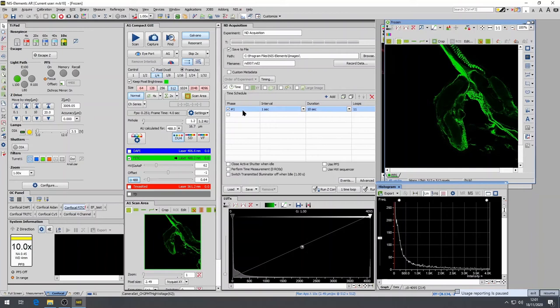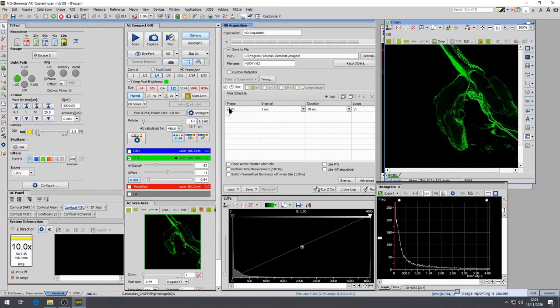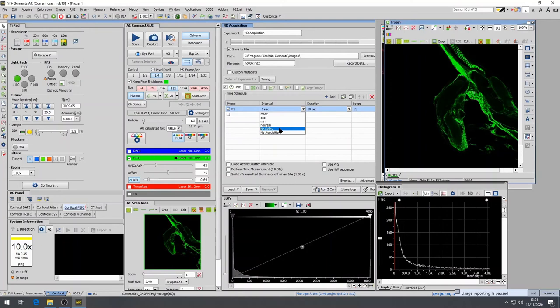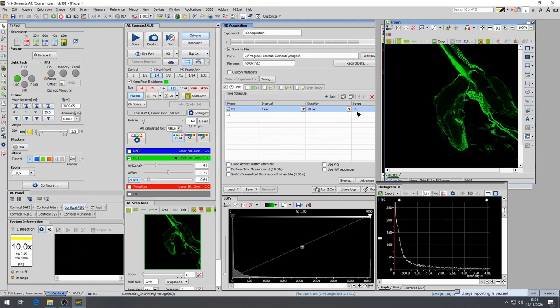Phase is the time sequence to be followed. Multiple phases can be established such that after one is completed the next ensues. This can be useful if the kinetics you are trying to observe change over time. Interval is the length of time of one image cycle. The duration is the total amount of time for the phase. You can select which is best for your experiment and the loops is the number of intervals that will occur.